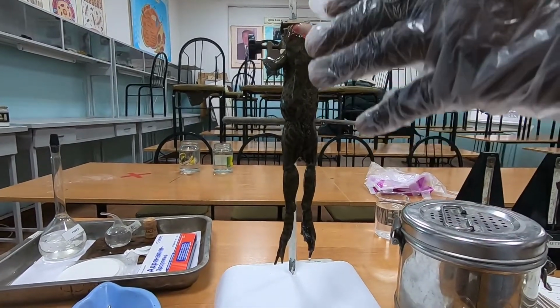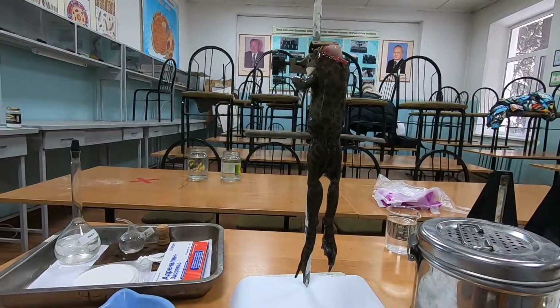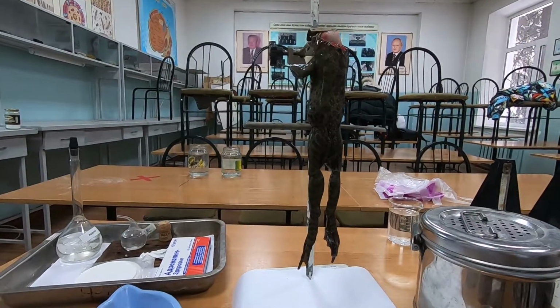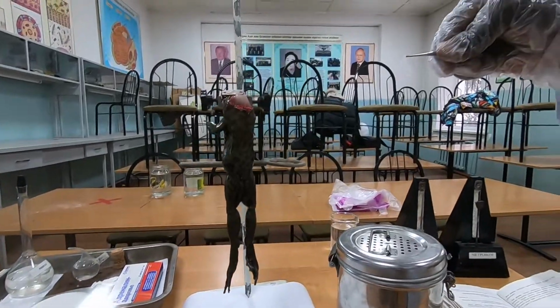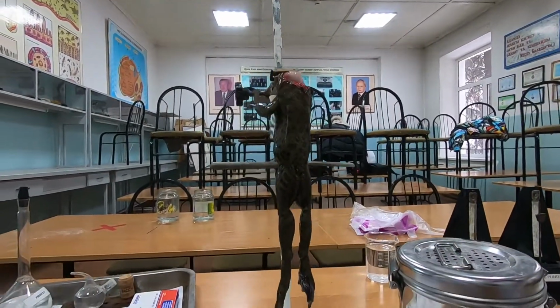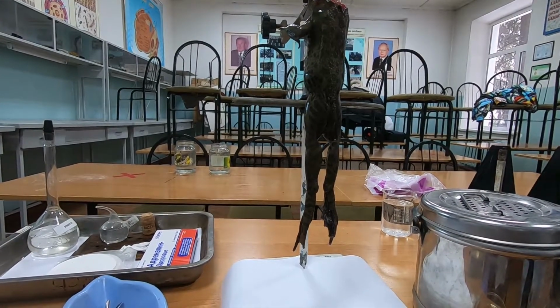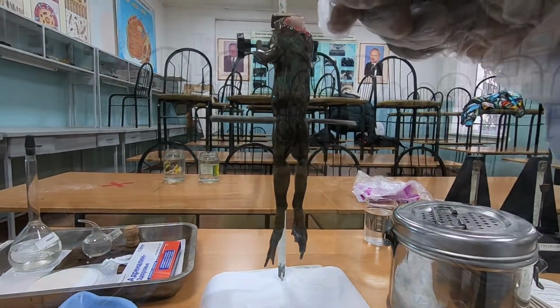When we apply 0.5% sulfuric acid, as you can see, after applying it, it took us a few seconds to see the reaction. Now, we're going to use the same. Let me take another one.